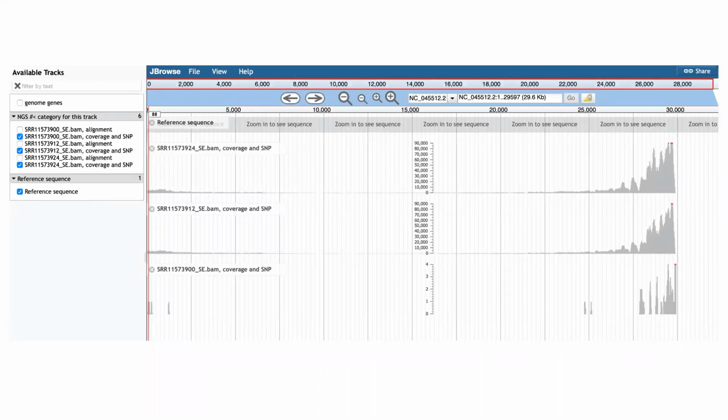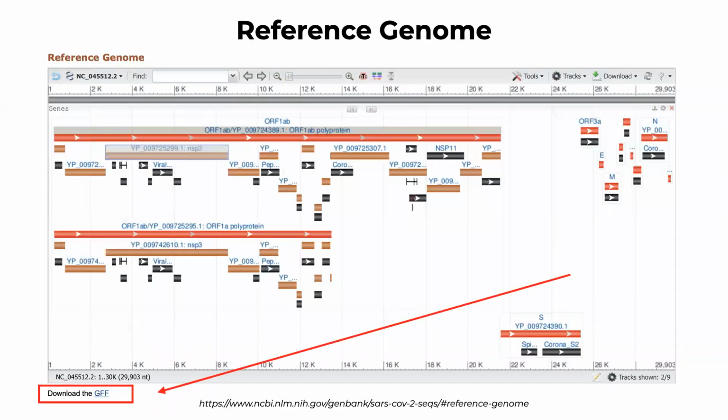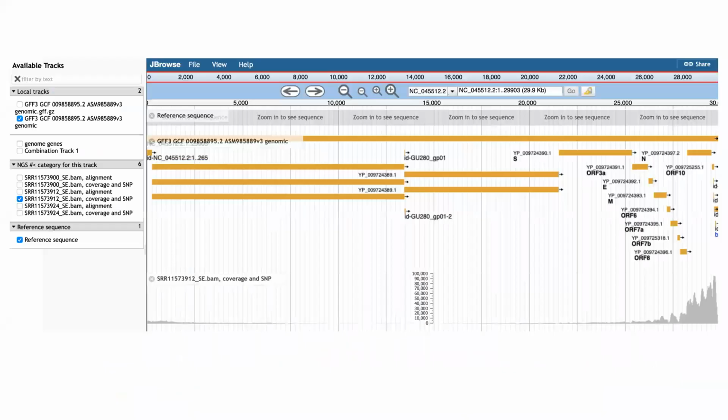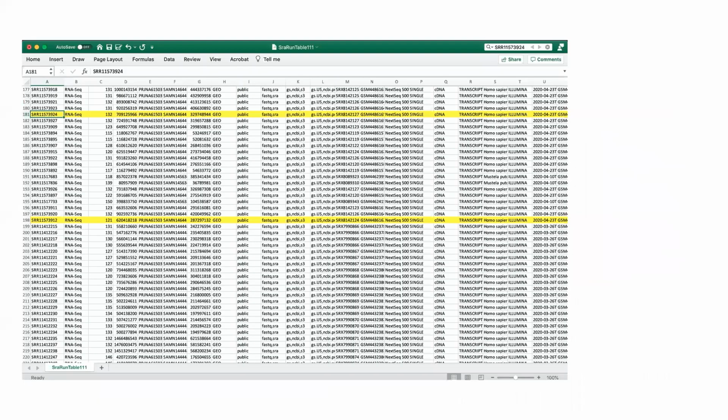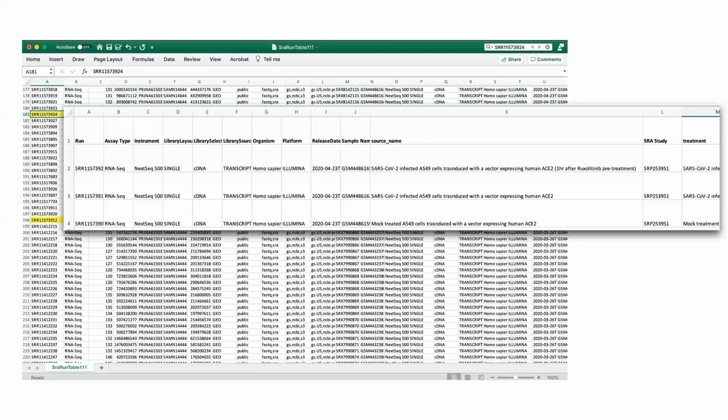Excellent. So does anyone have any questions about how to find files and how to map them onto the reference genome, and then how to get the results and be able to interpret some of those results to understand why we find something or not find something when we map those reads to the reference database and do not find a specific virus or do find a specific virus?